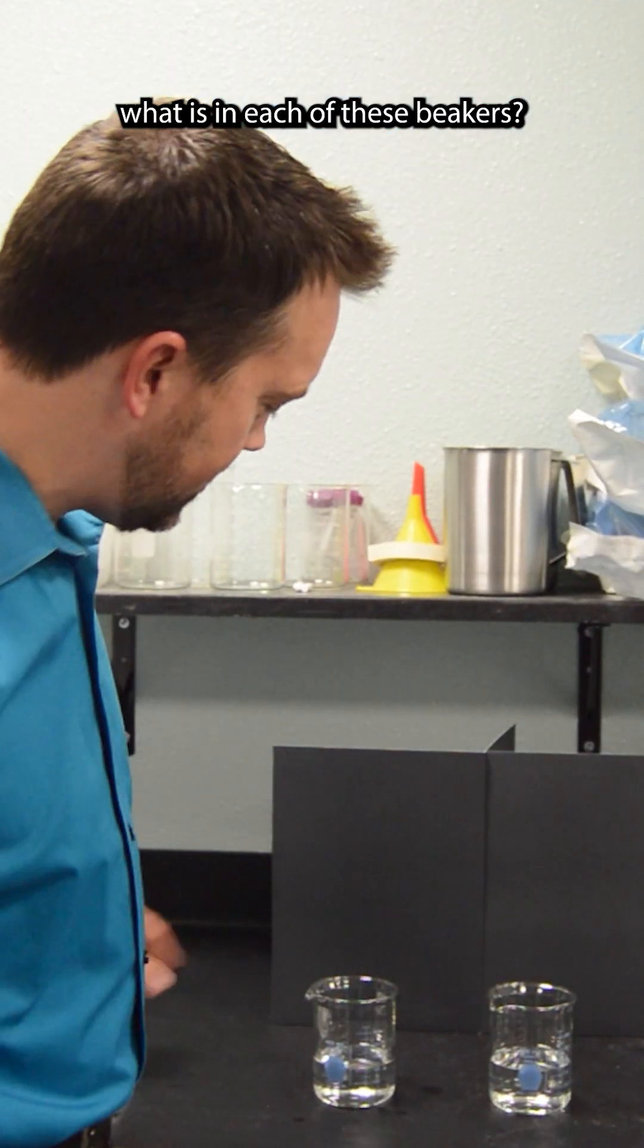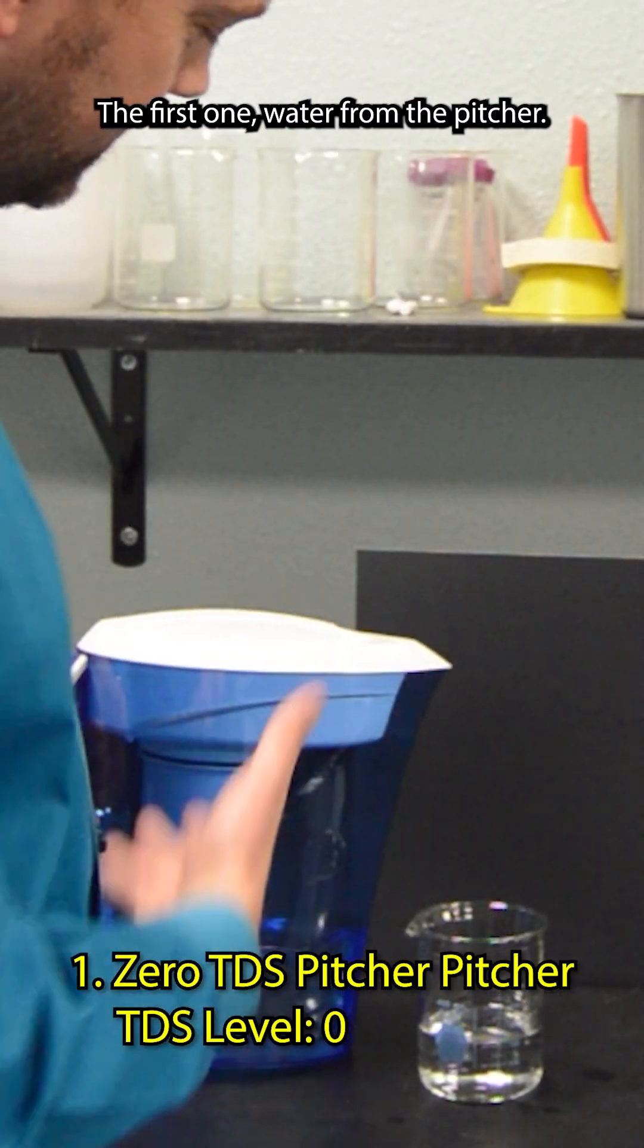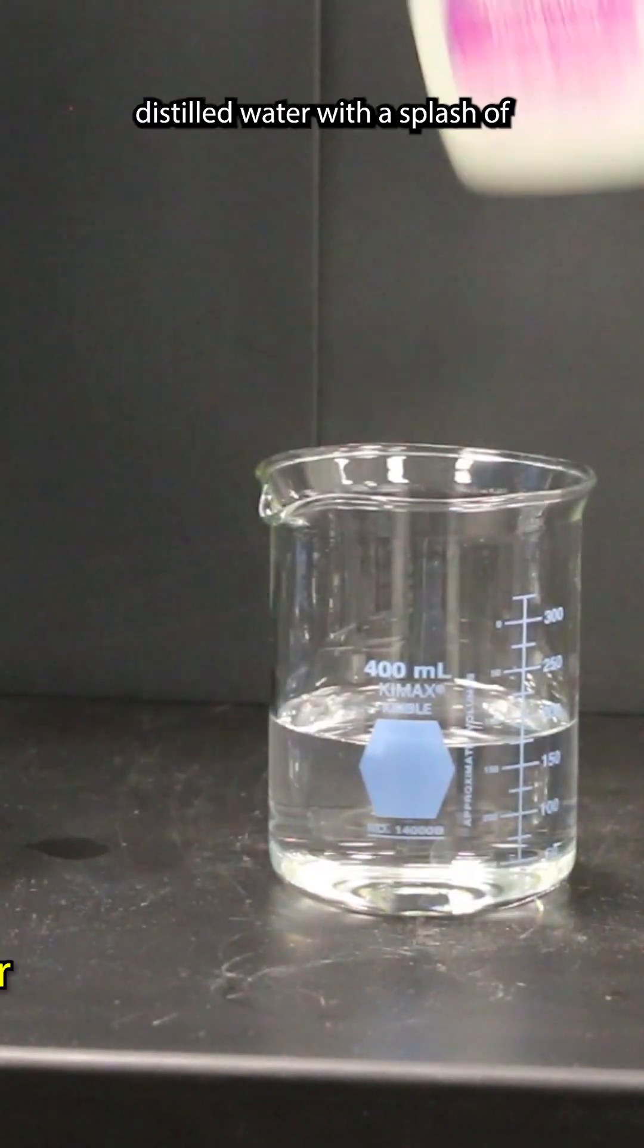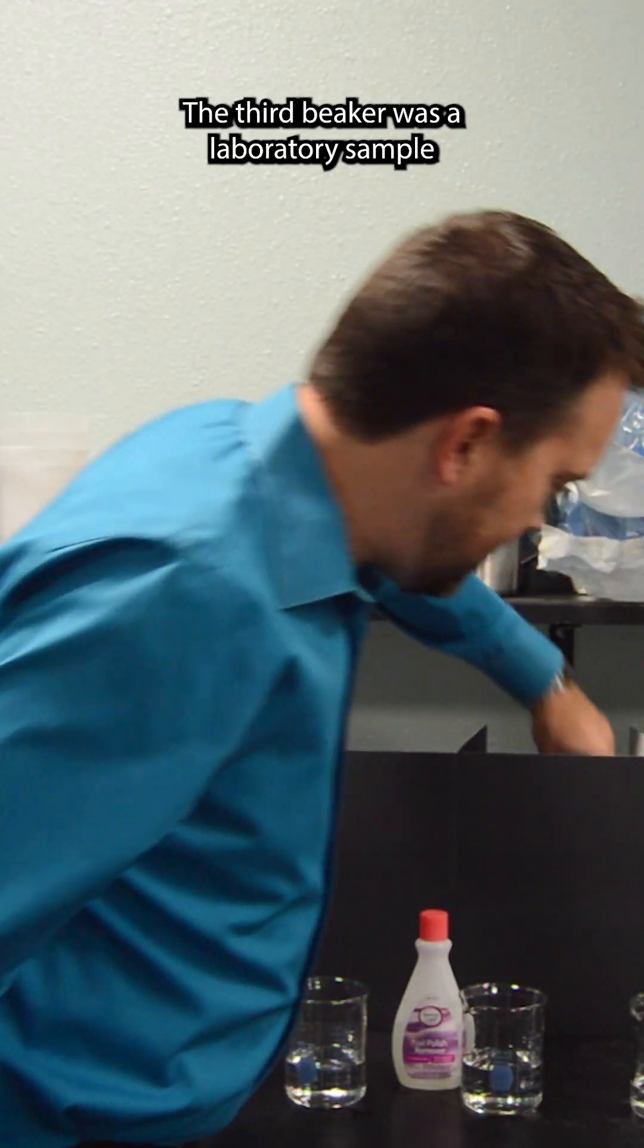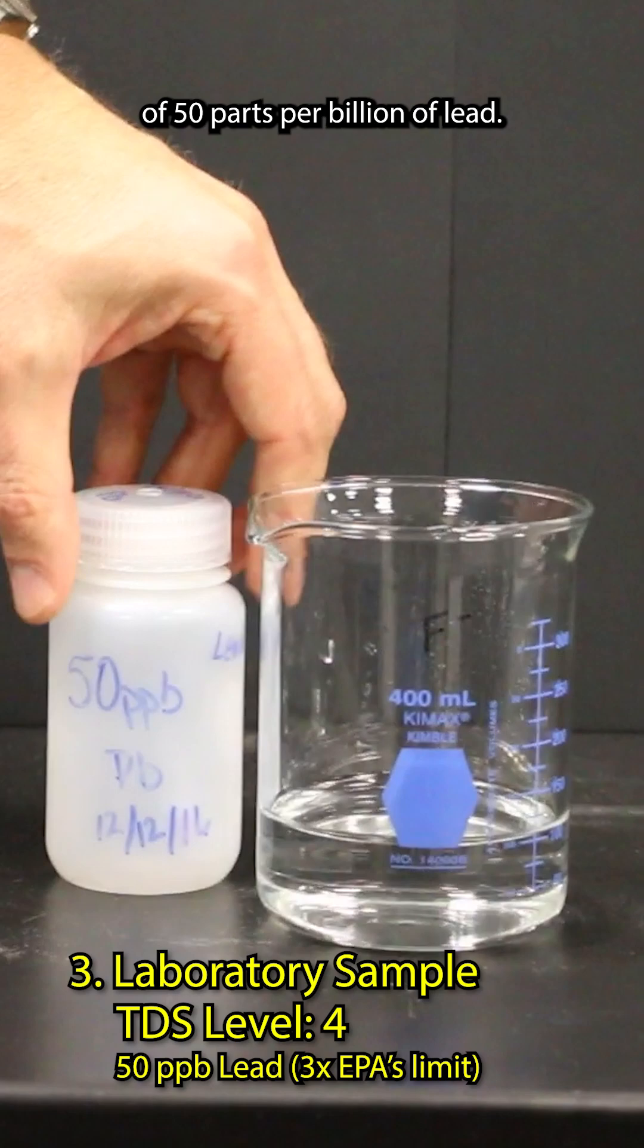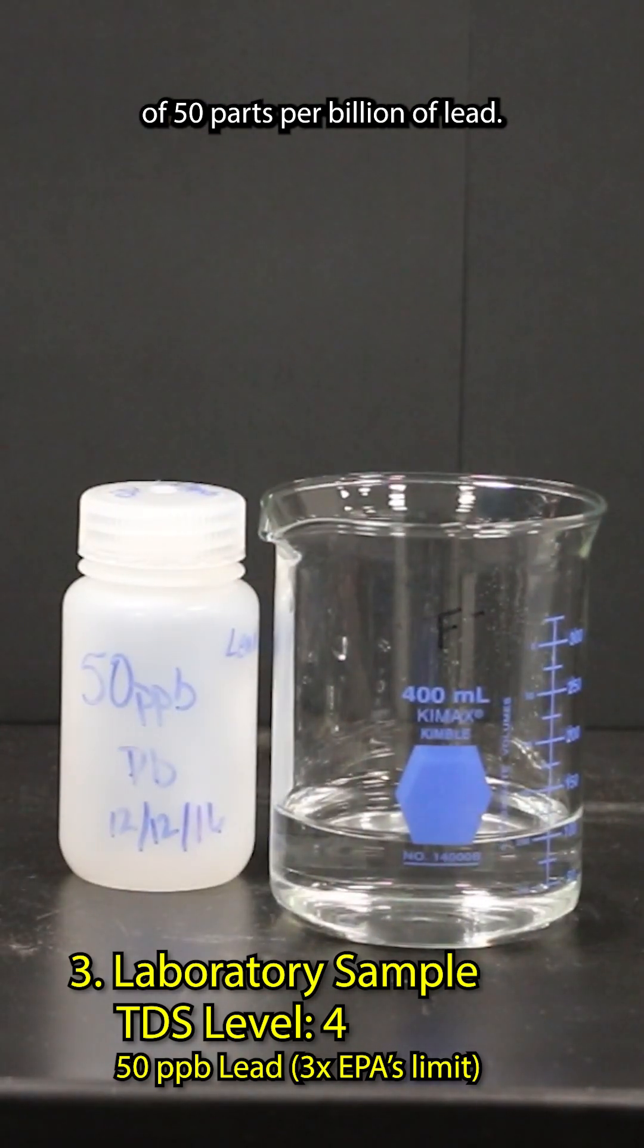What is in each of these beakers? The first one is water from the pitcher, the second is distilled water with a splash of nail polish remover. The third beaker is a laboratory sample of 50 parts per billion of lead.